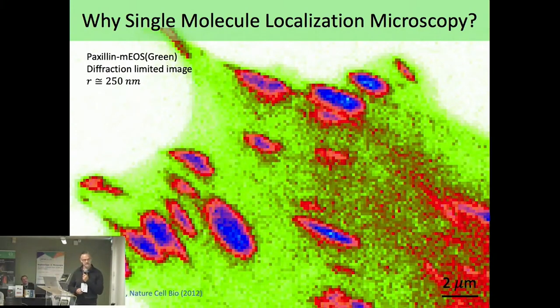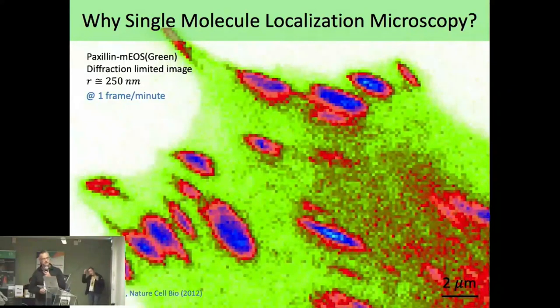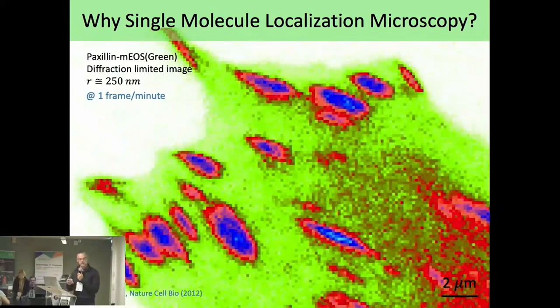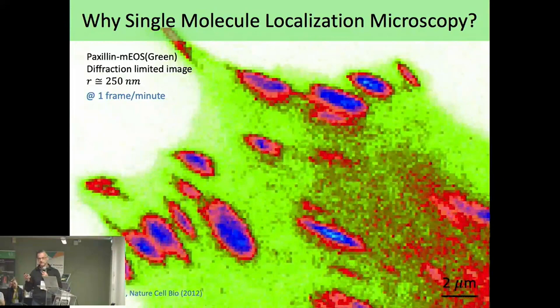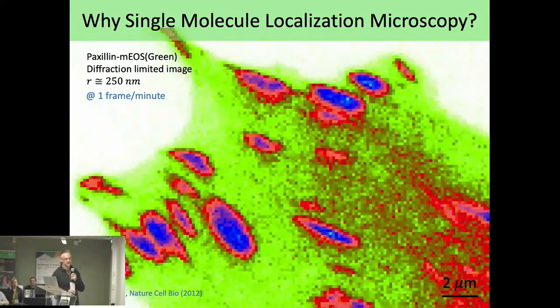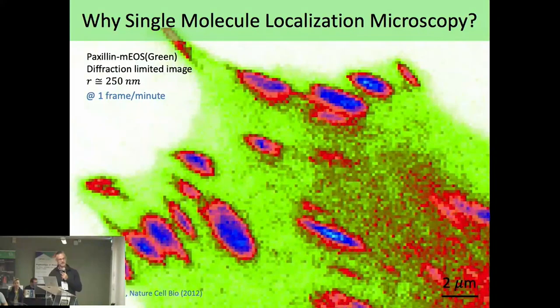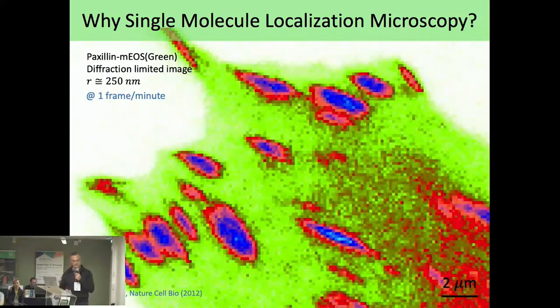What you see is not a lot of details. There's a high concentration of these molecules at the adhesion site, you can see maybe some around the membrane, and that's it. Even if you make a time-lapse movie, there's not much you can see, except that it starts to bleach. To analyze quantitative information on mobility, one would have used techniques like those presented by Cyril the day before, such as FRAP or FCS. But this information is still limited by diffraction. You would see that things recover maybe faster at the membrane compared to the adhesion site, but that's the global information you would get.